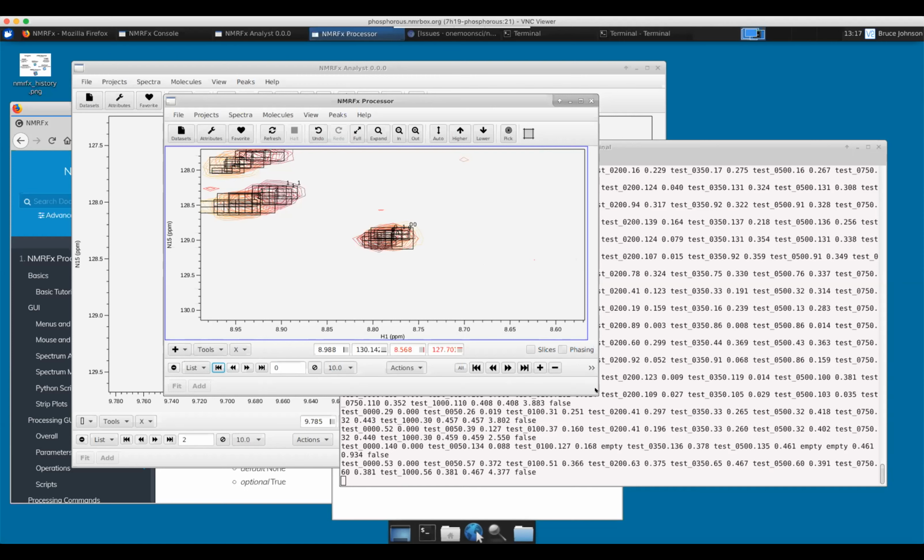Okay. So Bruce, one comment on that. Again, I'm going back to nmrbox20 because that's the only one I have experience with. So the pathfinder, when it is pretty obvious that the perturbation chemical shift is clear, it catches it. But sometimes, is there a threshold you have set where if it is not a very large perturbation, it doesn't catch it? Yeah, and I don't have time, especially since it's not working right here, and I've got to document all these.